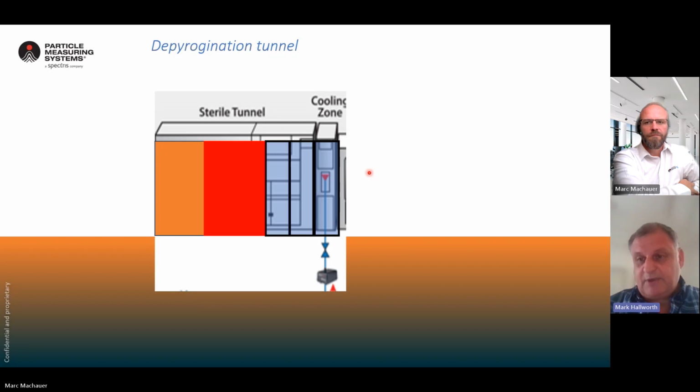Particle counters can be damaged by hot air. So if you monitor further upstream, anything more than about 35 degrees centigrade is going to damage the particle counter itself. So now you have to add cooling to that sample, and it becomes more of an engineering feat to demonstrate everything's okay. So the 2 meters of tubing is beyond the 1, but it's within the bounds of what ISO 14644 Part 21 is trying to recommend, no more than 2 meters.